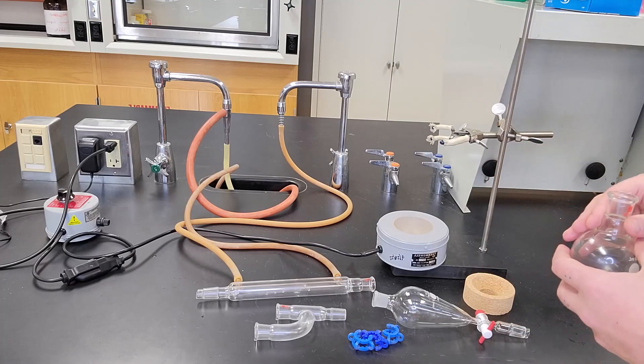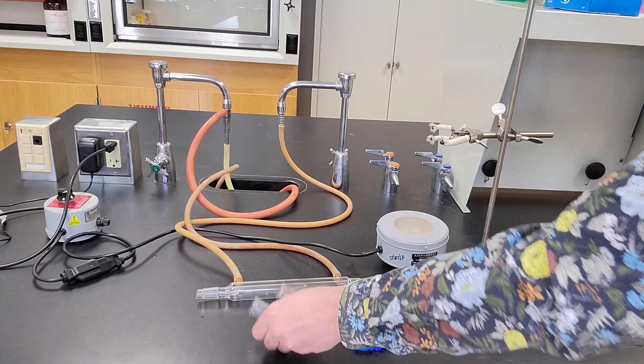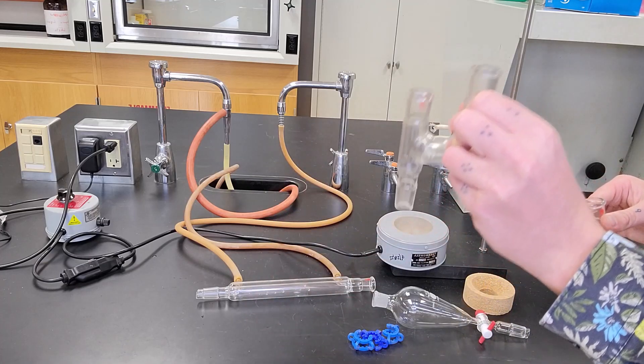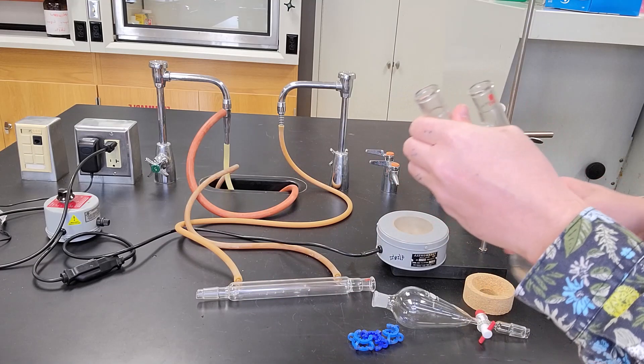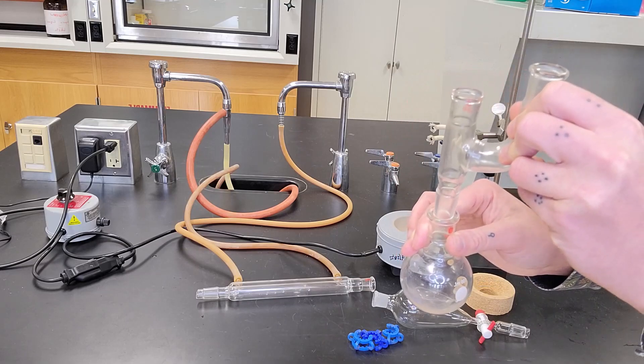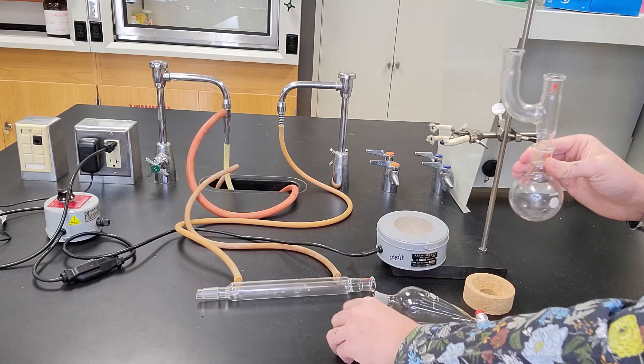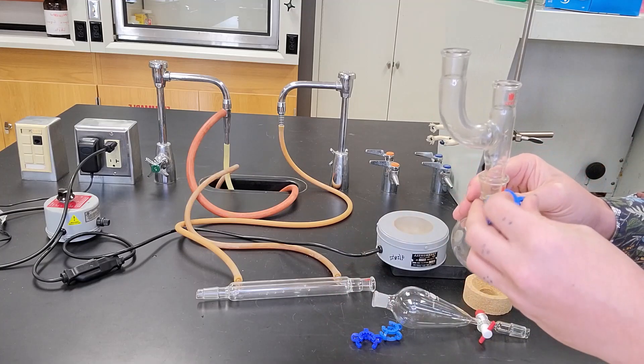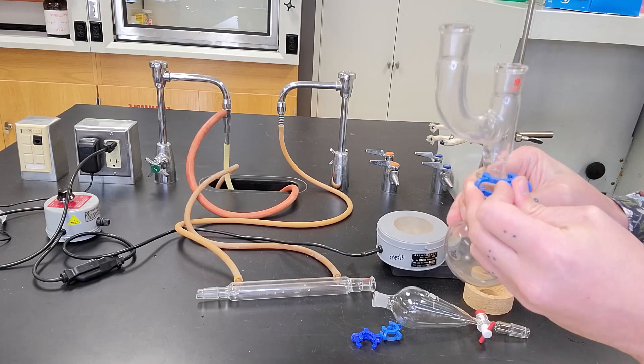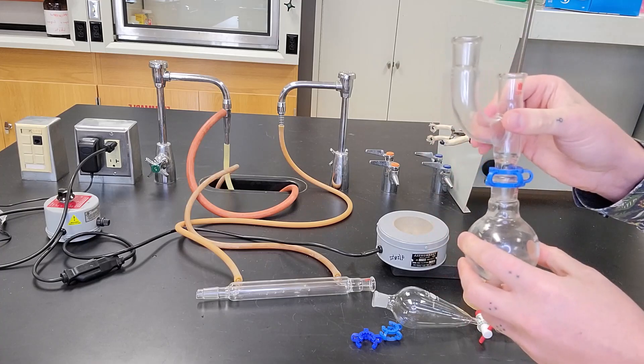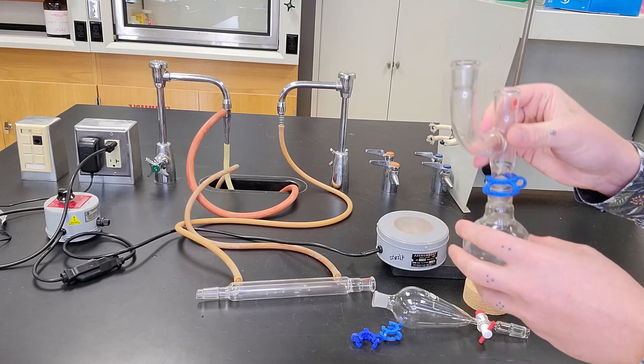So I'm going to take the Claisen adapter. This is the one with three ports. I'm going to take the Claisen adapter and put it in the round bottom flask. And again, I've already pre-greased all of these joints with silicone grease and I'm going to clip it. So I have my Claisen adapter with the round bottom flask at the bottom.